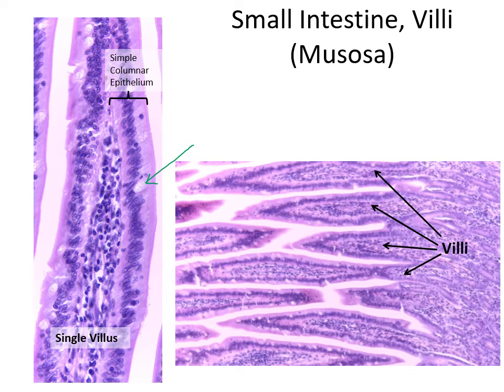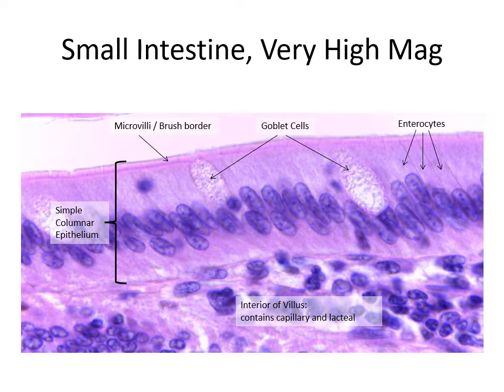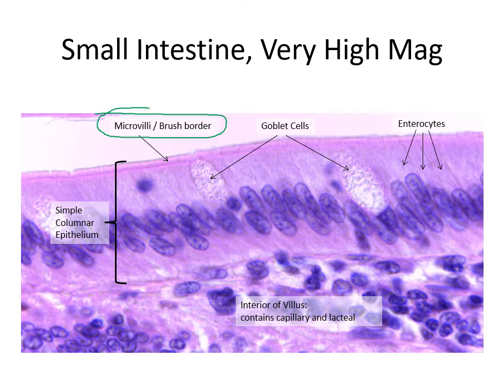This is our simple columnar epithelium lining each individual villus. And at very high magnification we can see the microvilli, also called the brush border. These are little extensions on the top of each of the simple columnar epithelial cells that serve to further increase surface area to facilitate absorption. Also the microvilli or brush border contain enzymes to help break nutrients down into their basic subunits — right down into amino acids and glucose or other monosaccharides.